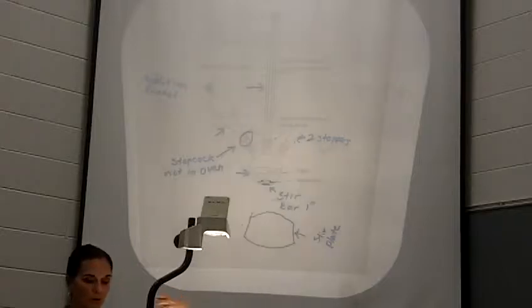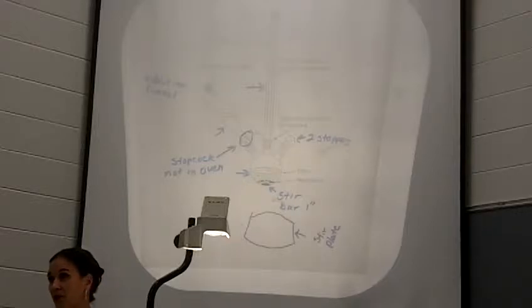Okay. Now, once you have this all set up, and you have your iodine in there, and you have the first portion of your alkyl bromide in there, you're going to use your hands to warm the solution. Okay. So we aren't going to heat it with a hot water bath. We're not going to heat it with any other external heating. You're going to put your hands underneath it and warm it. The reason for that is you don't need much heat to get ether hot. And this reaction is exothermic, so it doesn't take much to get it jump-started to get the reaction going, okay?